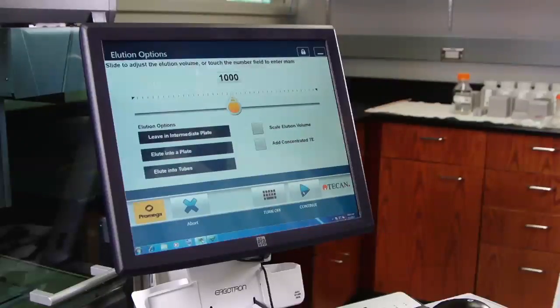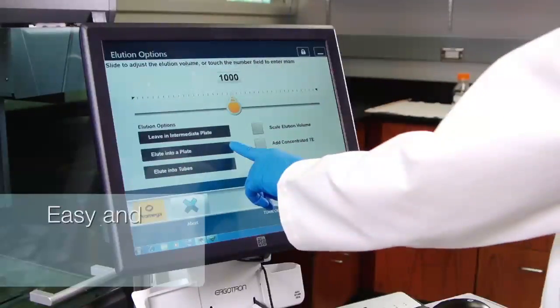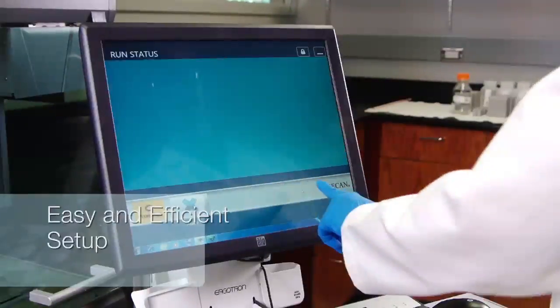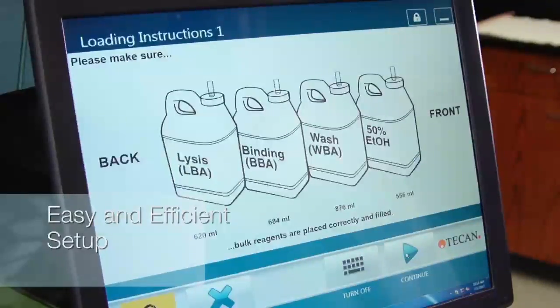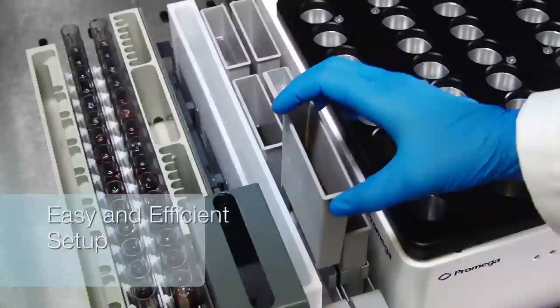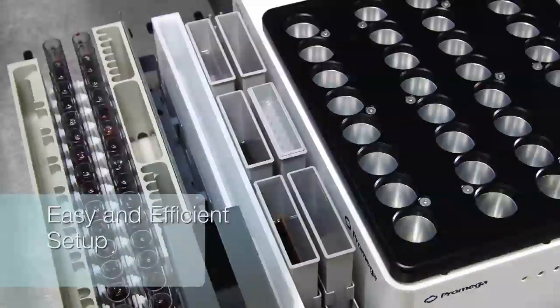The intuitive touch tools interface makes instrument setup easy and efficient. Large-volume reagents are housed in bulk containers while small-volume reagents are placed on the instrument deck.